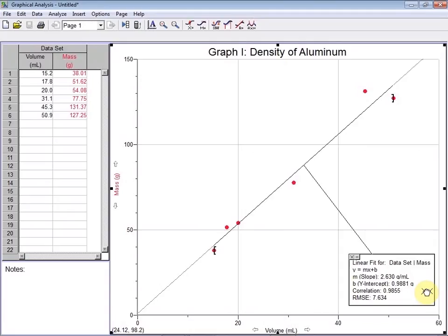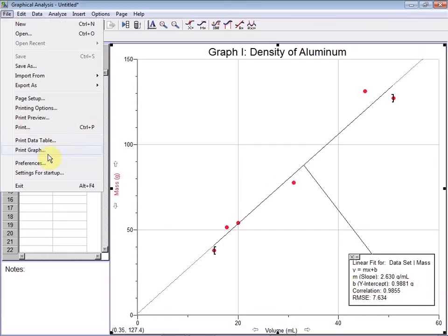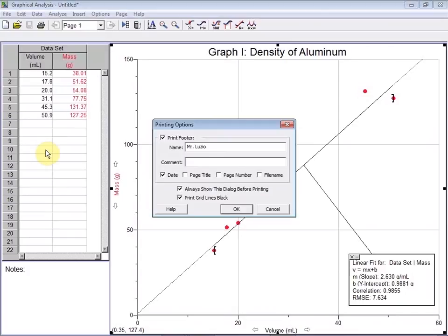In order to print just this graph, select File and Print Graph. Stay away from this Print option. So we'll select Print Graph. As with any assignment you turn in, you should include your name, the date, and we can add those here.